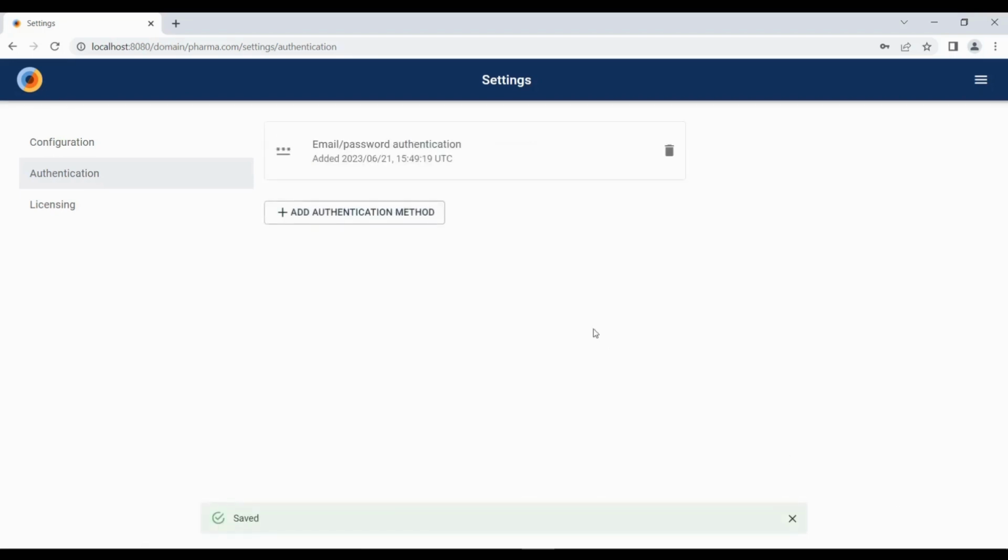If you don't want to use this method and you'd like to potentially use your Microsoft accounts, you can go into authentication method and use the OpenID Connect. So for this, you need to use certain protocols. So when talking to people at Refeyn, please do make sure to ask your IT team what are the protocols that are supported by your organization and talk to our representatives to make sure that it would actually work for you.